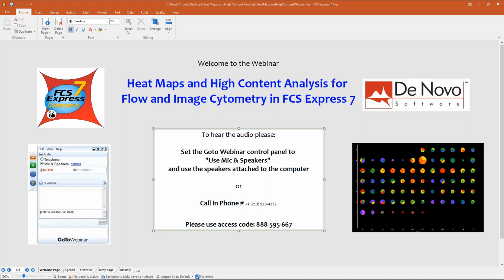So hello everyone, and thanks for joining me today for this webinar on heat maps and high content analysis for both flow and image cytometry data in FCS Express 7.